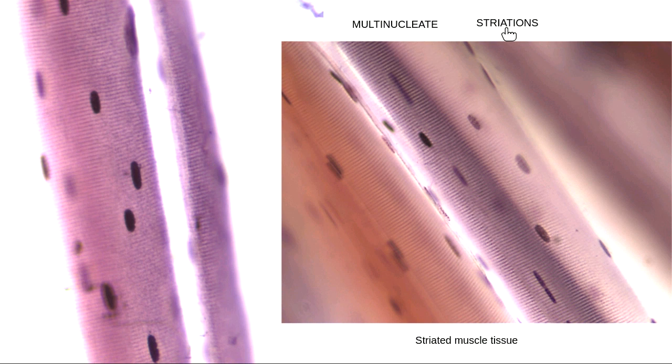Nicole asked if the stripes are going up and down. Yeah, we could kind of consider it that way. When we look at it, if I see my cell in this arrangement, see how it's going kind of from the top to the bottom, and then the stripes kind of go this opposite direction. It's actually the same thing when I back up to the other tissue.